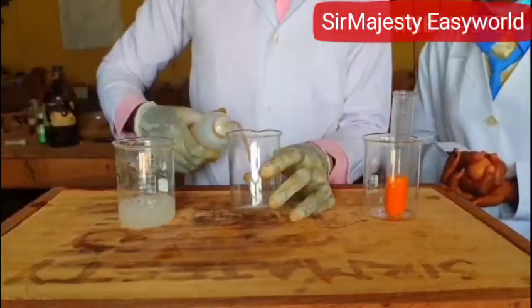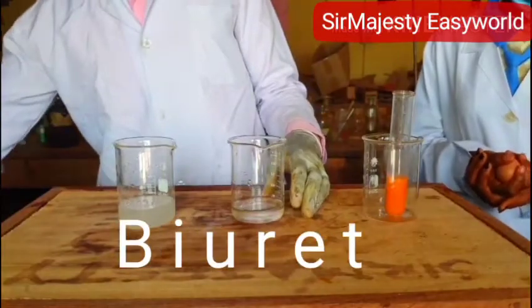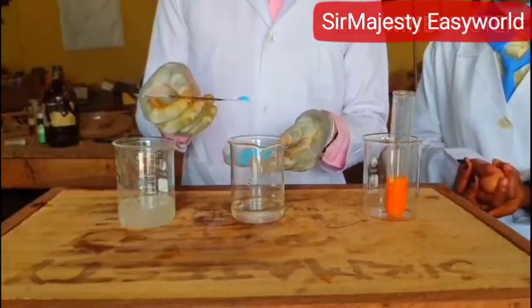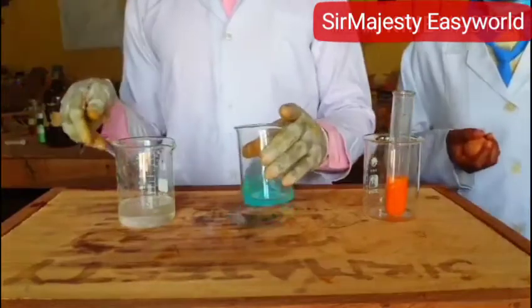Then you need 1% copper sulfate solution. I am making another solution. What are we doing? Biuret test — B-I-U-R-E-T. The 1% means just a dilute solution of it. What are the two things we require for the Biuret test? 28% sodium hydroxide and 1% copper sulfate solution.